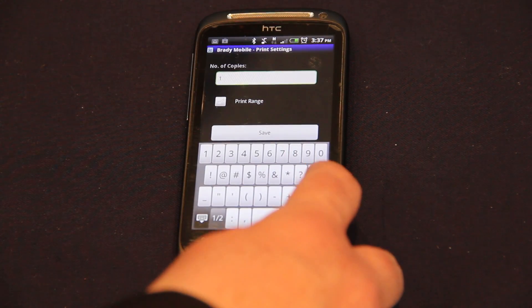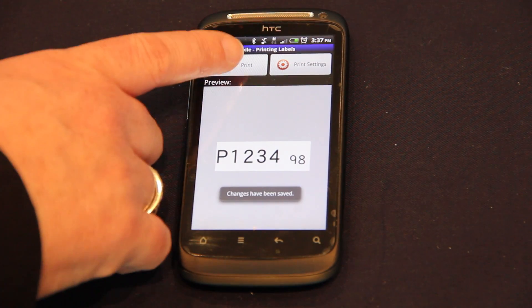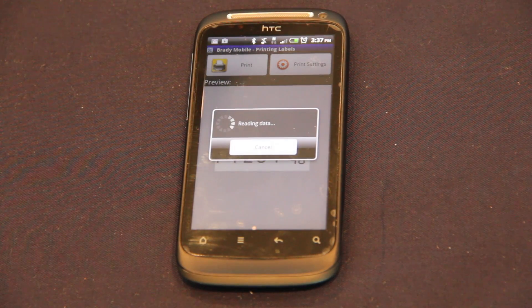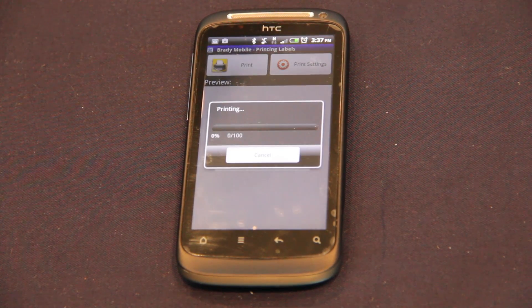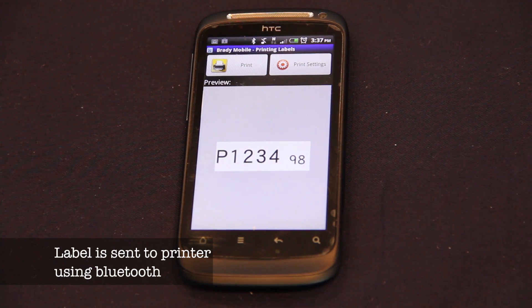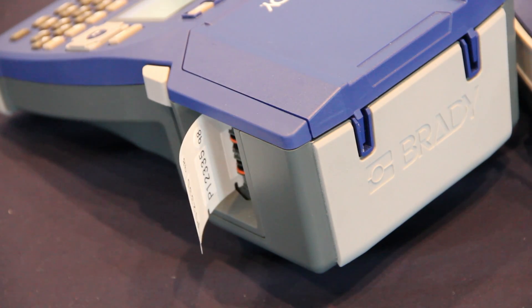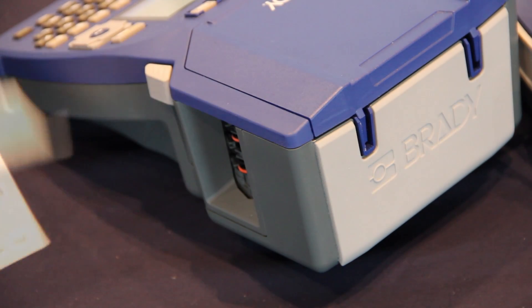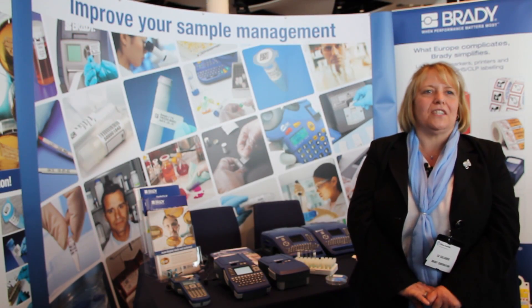Choose how many you want to print, then select your printer — I have lots of printers here, so just choose your printer and select. All of the Brady product range is available from Fisher Scientific.